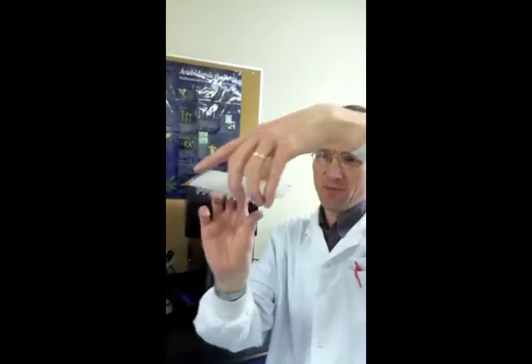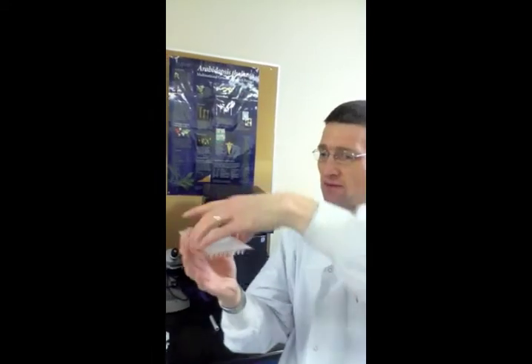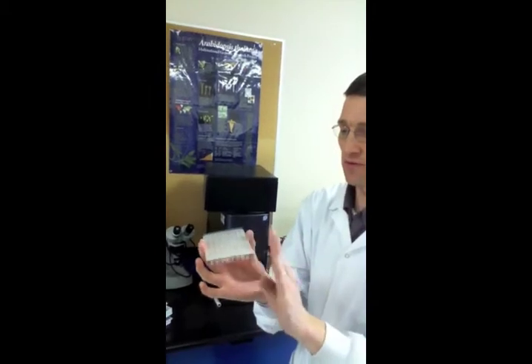So I like to just give them a bit of a mix, although we're boiling these things for another 3 minutes just before the thermocycling reaction starts. So I'm sure that'll do plenty of thermal mixing all by itself. Nevertheless.